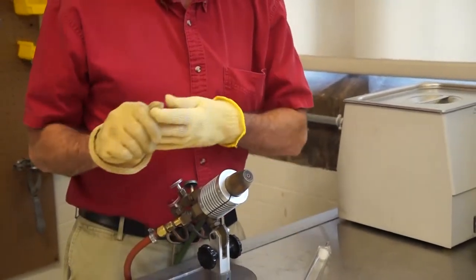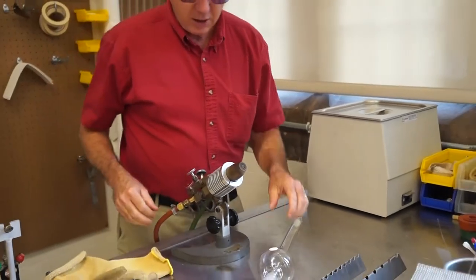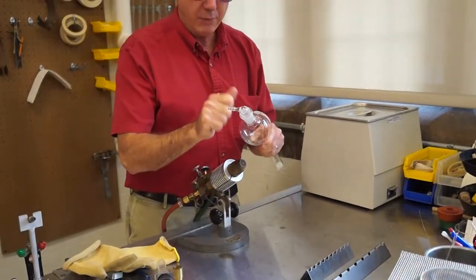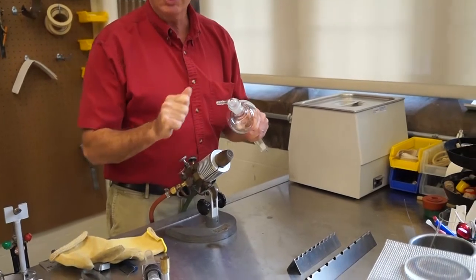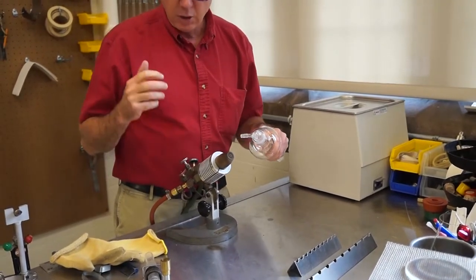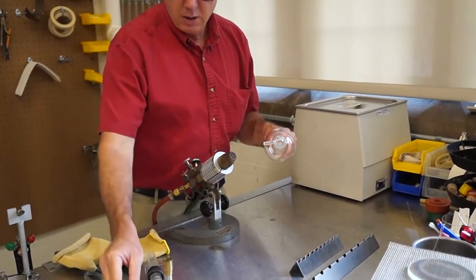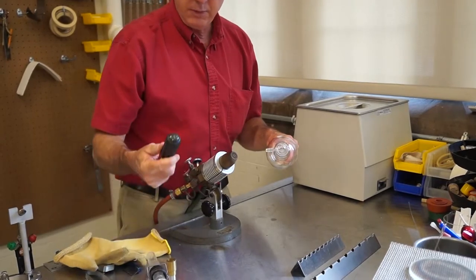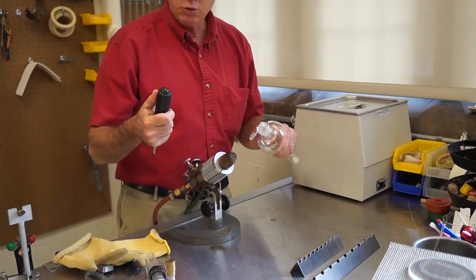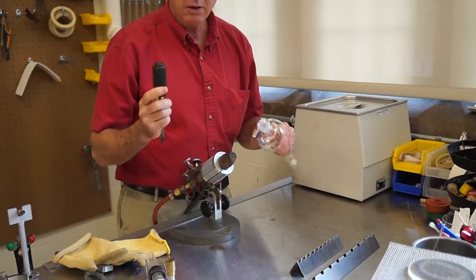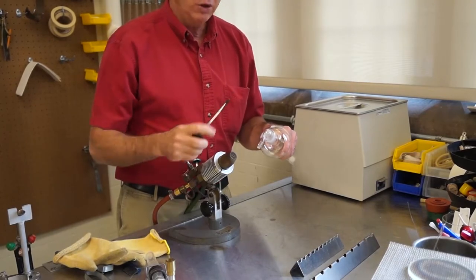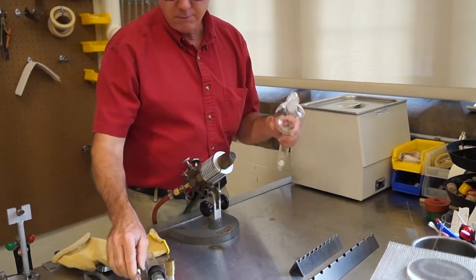If that doesn't work, the next thing you can try is you want to take and you want to be able to wrap this and the vibration kind of jars it loose. You want to use something rigid. Here's a handle of a screwdriver, but it's rubber and that's not good enough. You certainly don't want to use any metal against it. That's a little too hard.